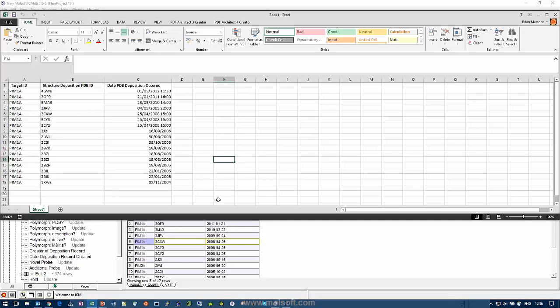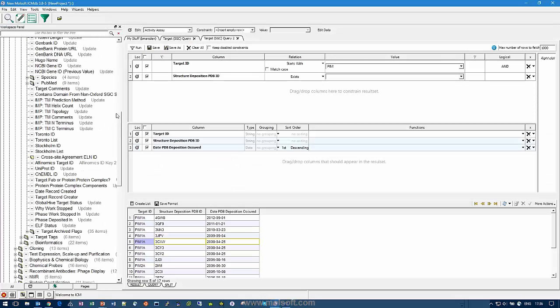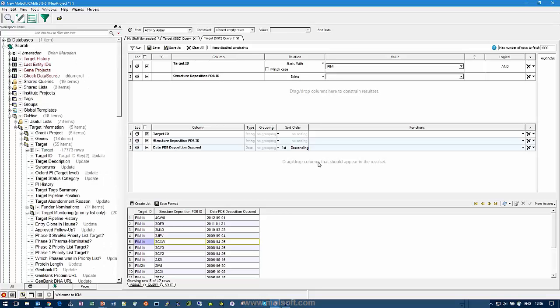What we always recommend to people is, you do your initial data mining within Scarab, and then when you've got what you need, you immediately put it into Excel, because that tends to be the environment that people are most used to, and they can manipulate what they want in that regard. Now, that doesn't look particularly magical, but I can tell you what was really cool about what just happened in that query: a very complex SQL query was built that jumped through approximately 16 tables.